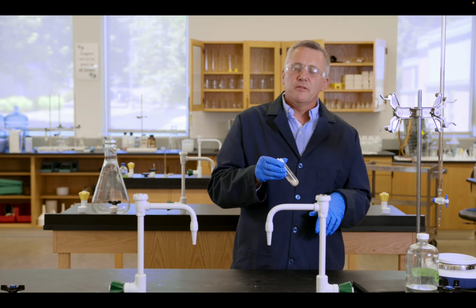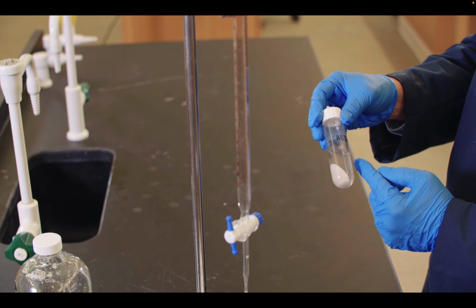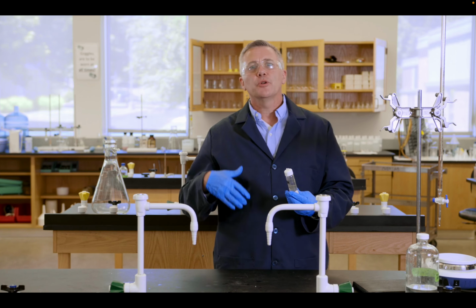Okay, so we've added the 52.8 milliliters, and then we centrifuged it, and so notice we have the pellet, and a little bit of that other solution still remaining, so we're getting rid of some of the colors, it becomes a little bit more clear. So what we're going to do in this next step is we're actually going to pull off the supernatant. That is, we want the liquid in this case, and now we want to go to 75%.